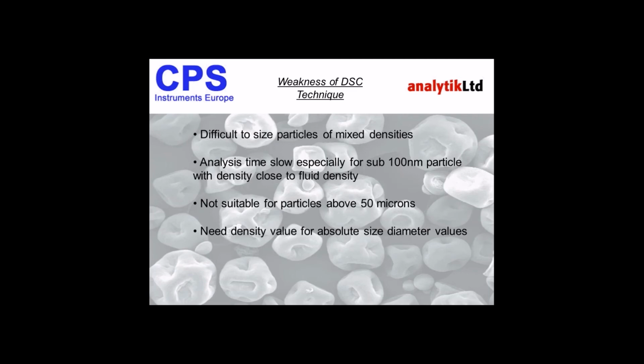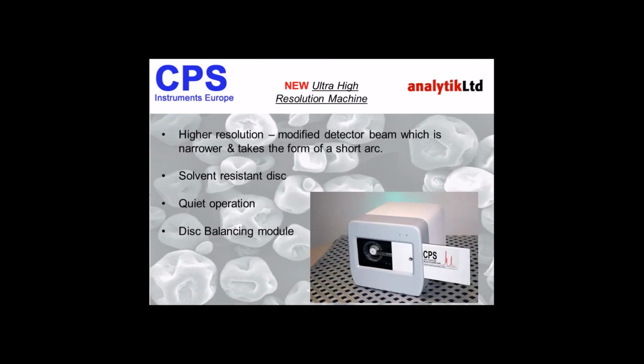This can be done with two different fluid density gradients using a standard disk, but also with low density samples, you can actually run the sample on a standard disk and also repeat the run on a low density disk and still achieve the same calculations.